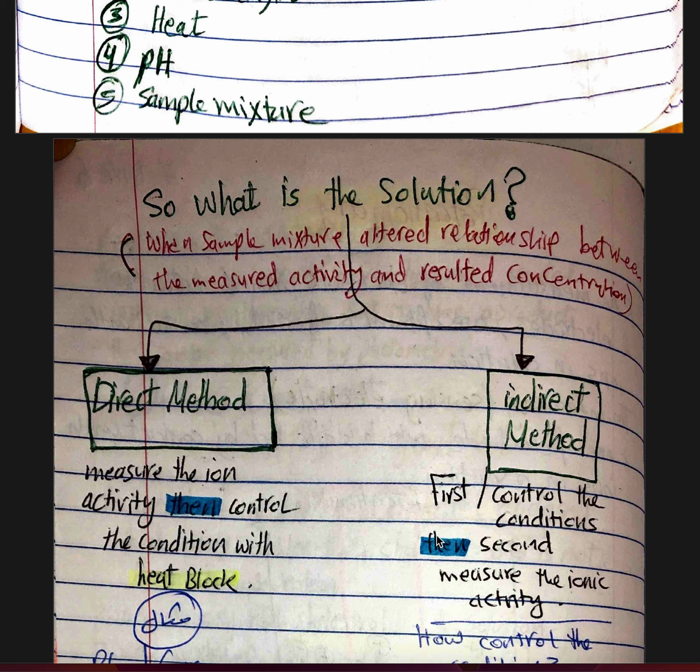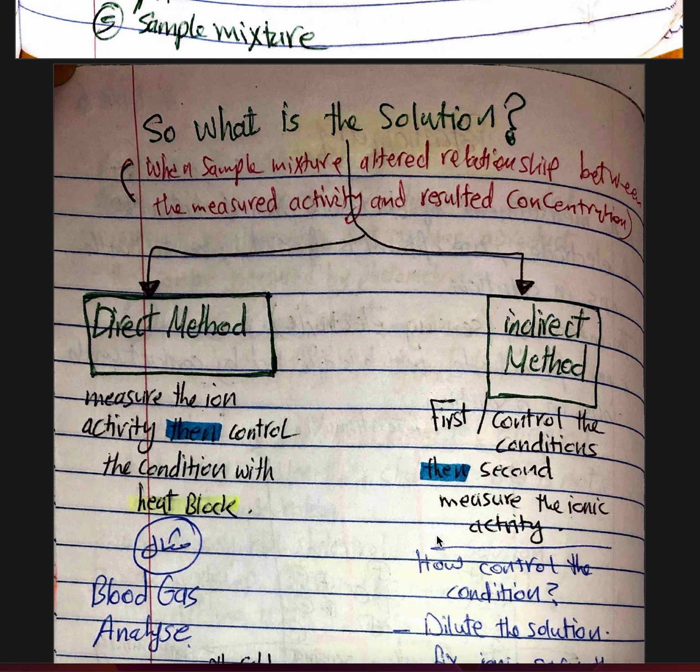So what is a solution? The sample mixture can alter the relationship between the measured activity and the resulting concentration. So we actually have different methods.